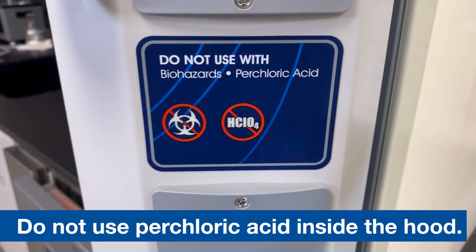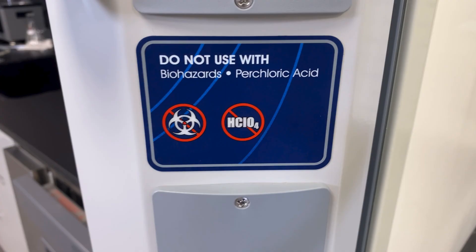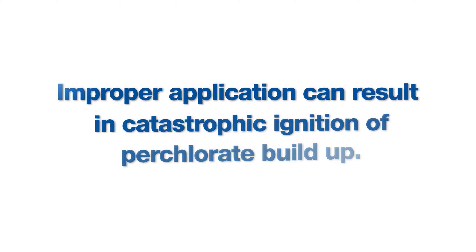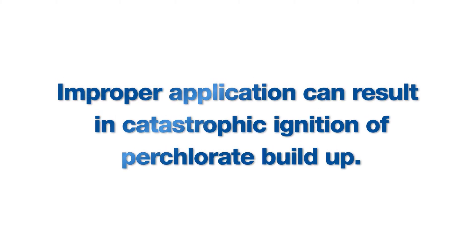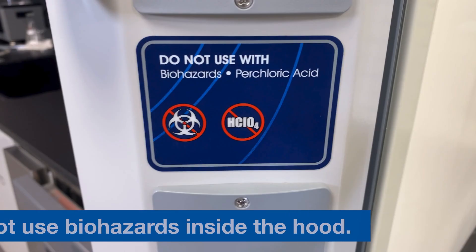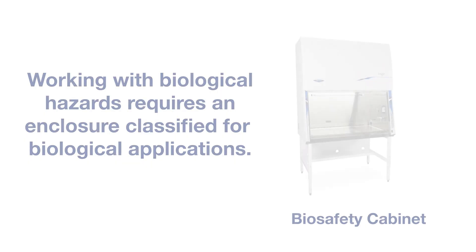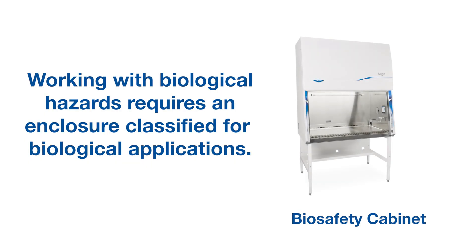Do not use perchloric acid in a fume hood or system that is not specifically designed for that hazard. Improper application can result in catastrophic ignition of perchloric buildup. Do not use the hood with biohazards. Remember, your chemical fume hood is designed for a very specific family of hazardous substances. Working with biological hazards requires the use of an enclosure or cabinet classified for biological applications.